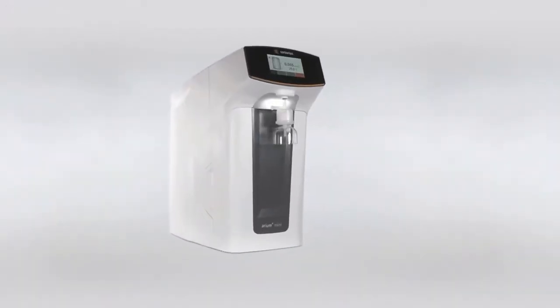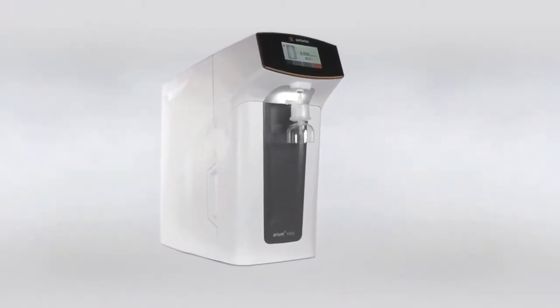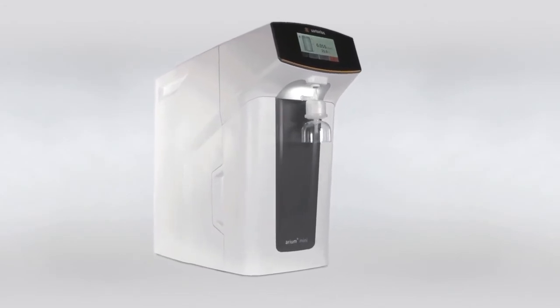Arium Mini UltraPure Water System. The revolutionary combination of the highest water quality and convenience.